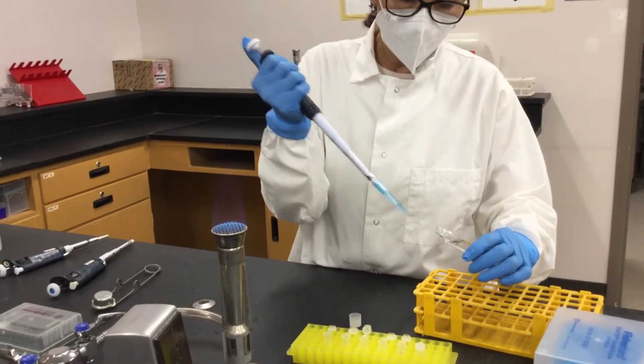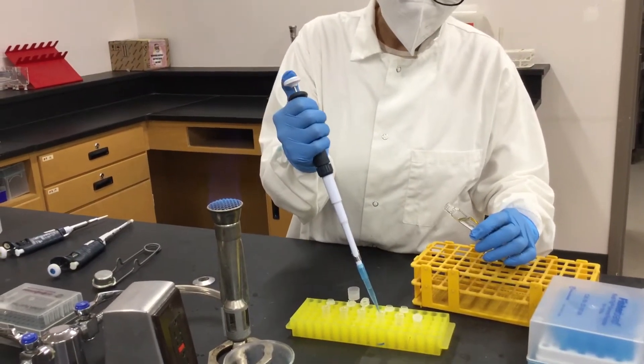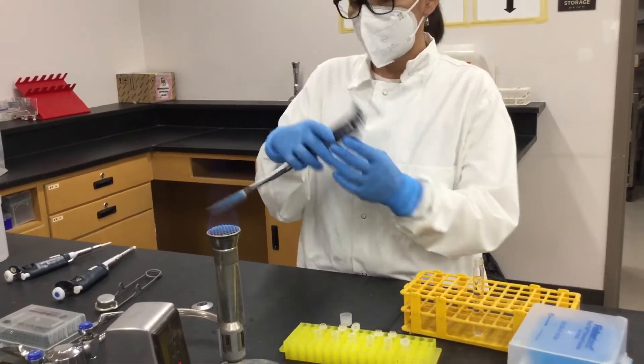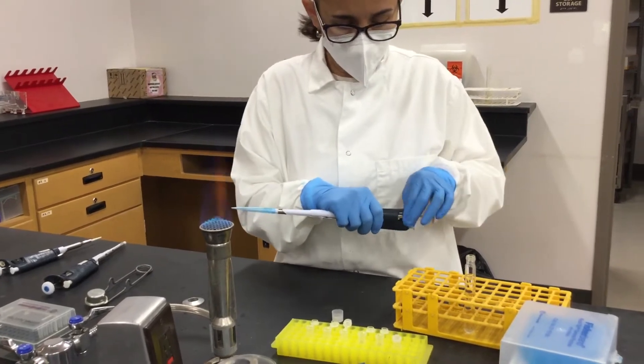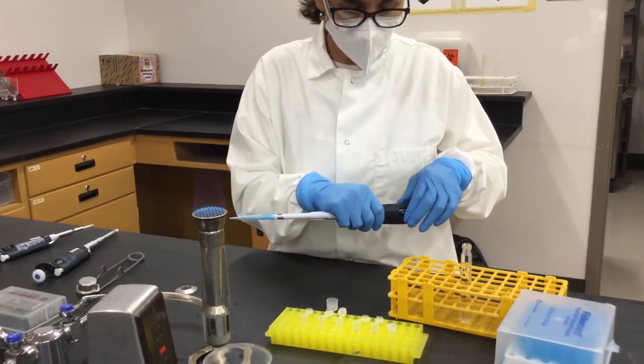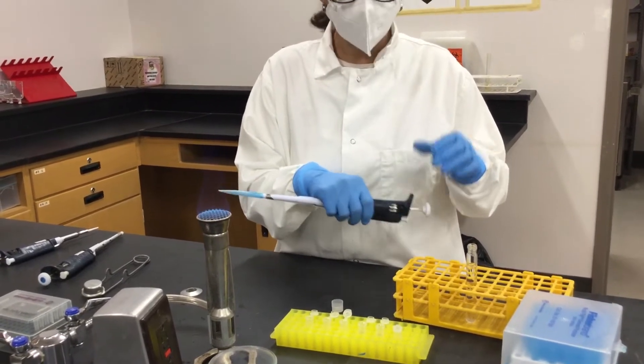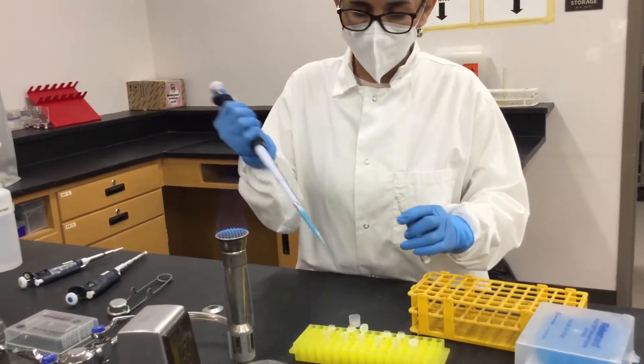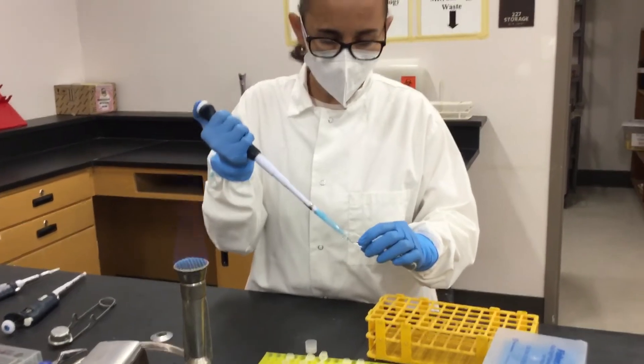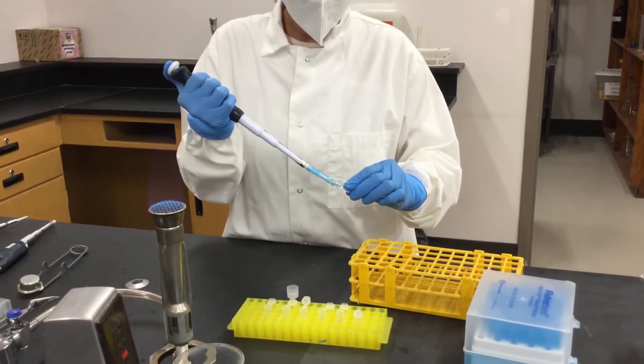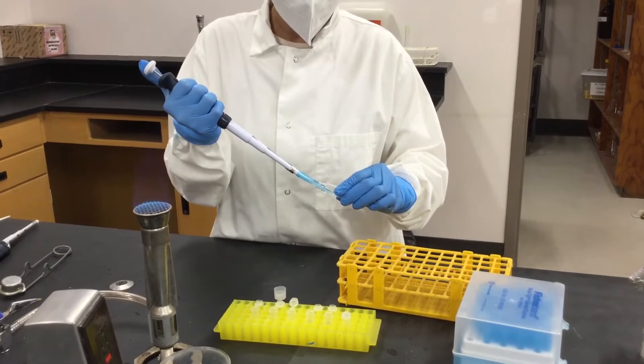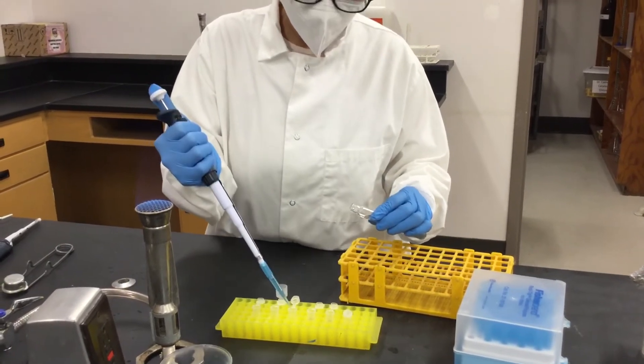And then for the next we're going to use 900 microliters. So I will set this to 900 microliters, which is 0-9-0, and then add to these three each of them 900 microliters of water.